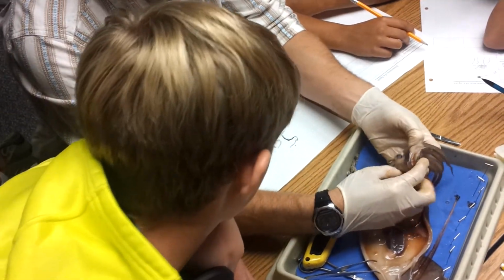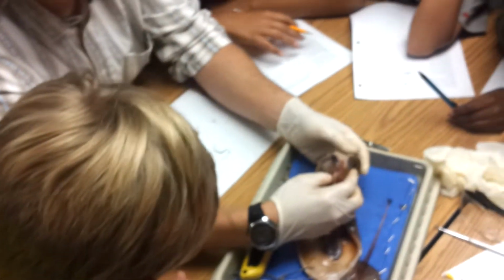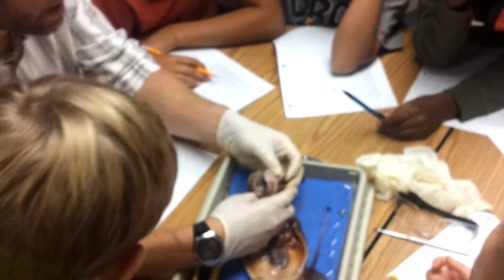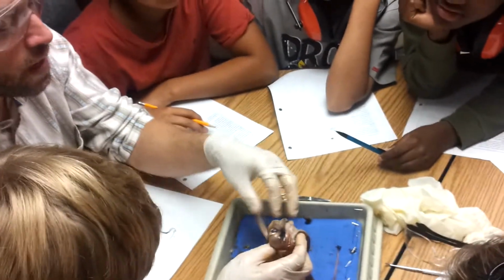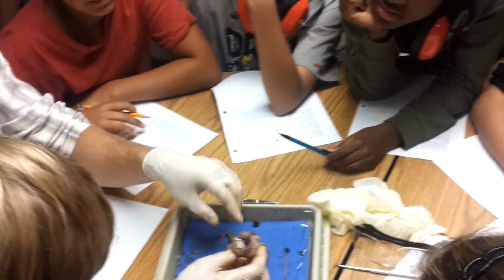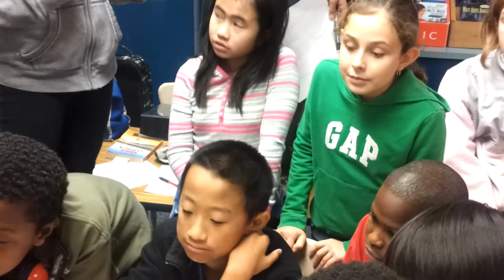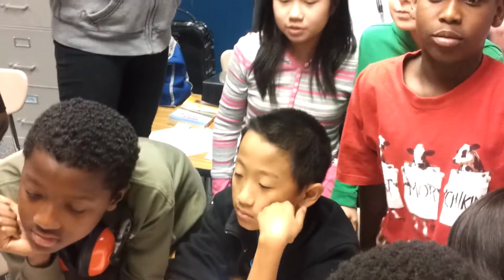So we've got a creature that's really well adapted to hunt. It's got big eyes. It's got long tentacles to grab things, a whole bunch of arms to hold on to them with lots of suction cups and little teeth. Okay? It's got a great big stomach. It's fast. It's got a jet to rocket through the water. So an altogether well-developed animal. If you flip it over, it'll look like a stingray.